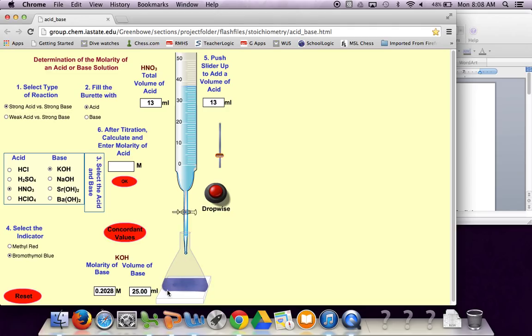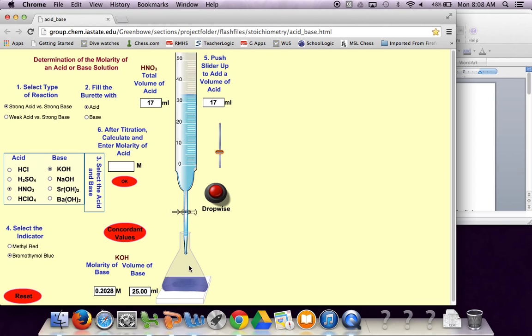Our solution remained blue so it's still basic. We're going to add a little bit more until we get our ideal color, which is to add maybe one or two drops and get this to be green. If we go to yellow then we went too far.